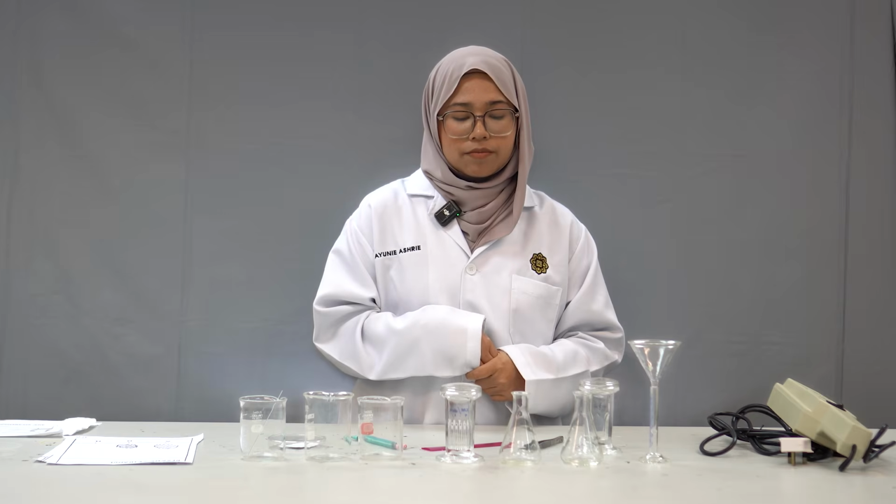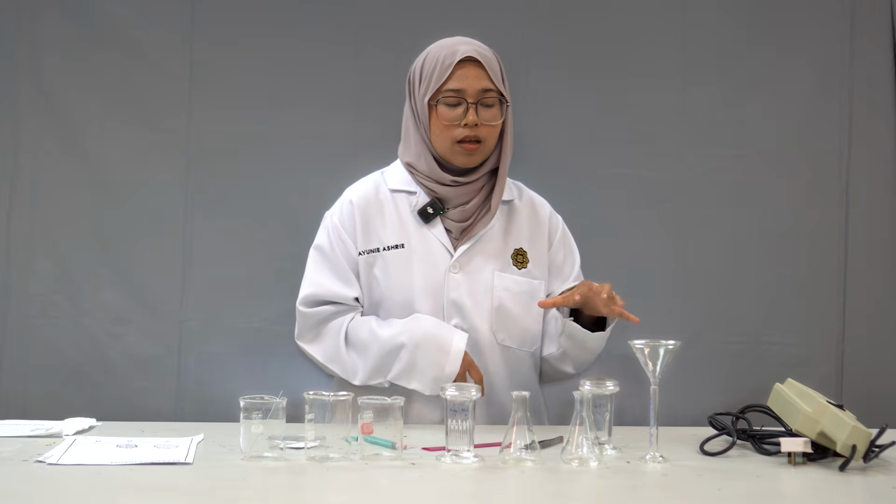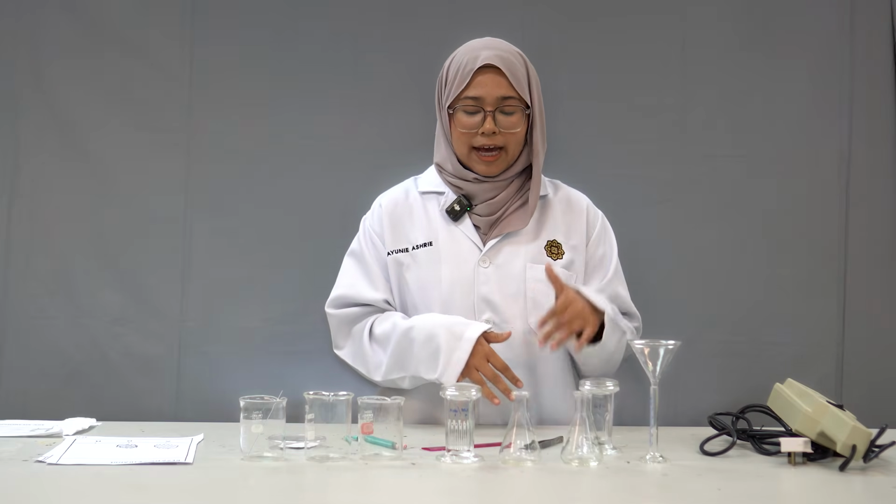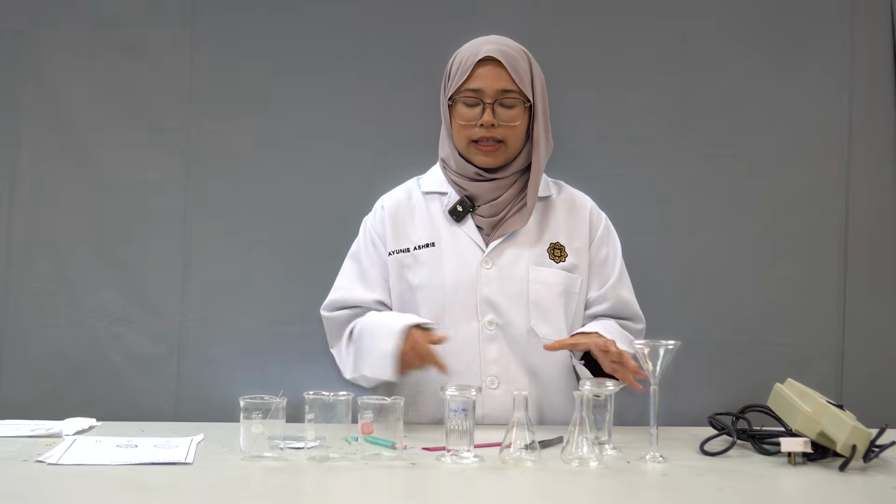And then during the developing process, make sure the solvent level is below the sample spots, because if it's too high, the sample will dissolve directly into the solvent instead of separating properly.